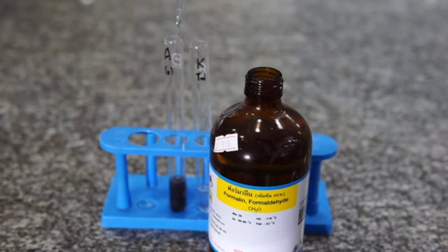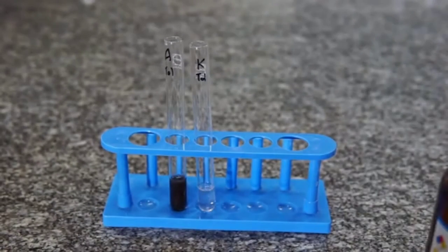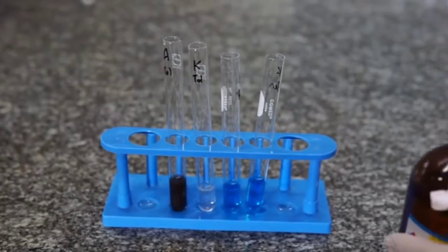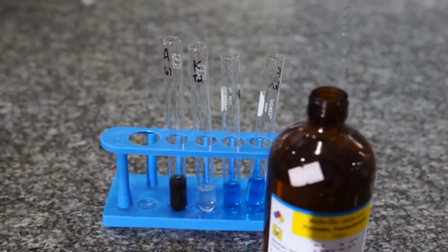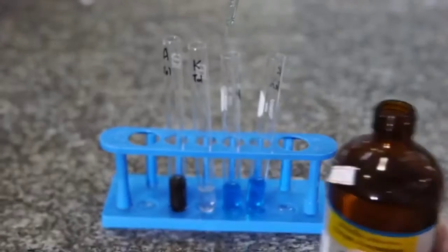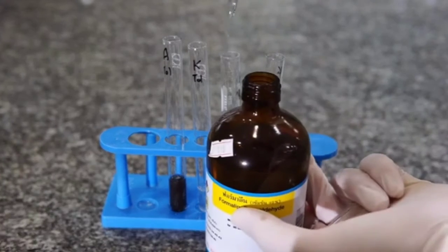You can see that lovely grey-black precipitate which is forming straight away. And with the Benedict's solution, you can see that there is no reaction yet.